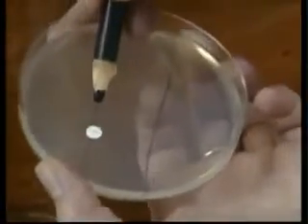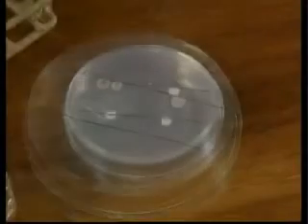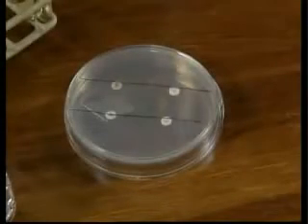Four discs, each containing a different antibiotic, are carefully placed at the interface between the test and the control inocula. The plates are then incubated overnight.